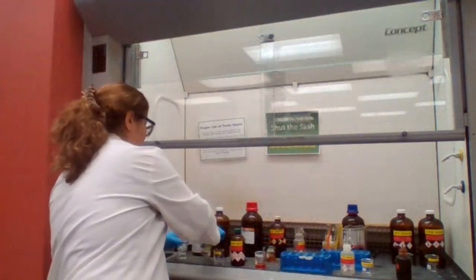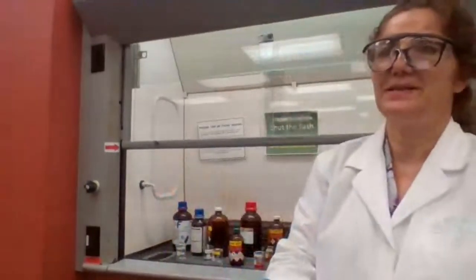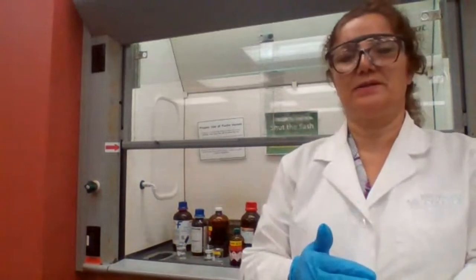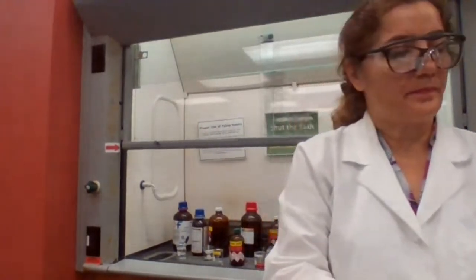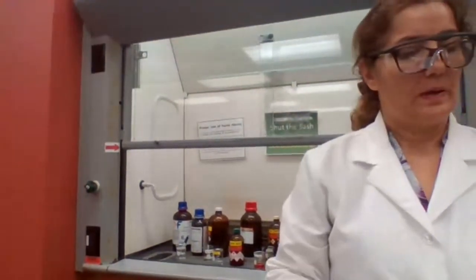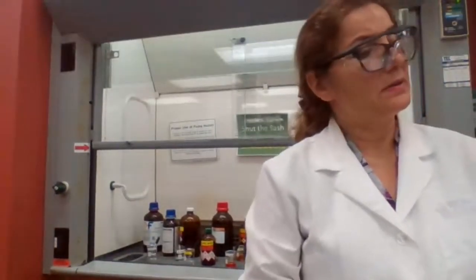At the same time, I don't think we need the Schiff reagent because we already had the Tollens test and the chromic acid test, and both of them confirmed that only aldehyde can be oxidized and the ketones cannot be oxidized. Okay. Any questions?